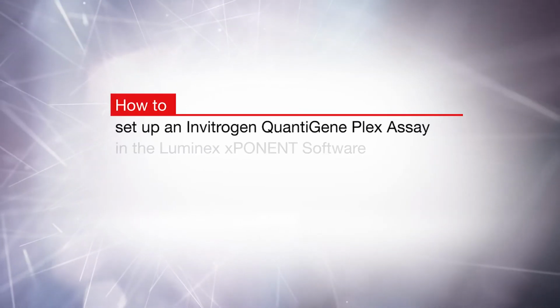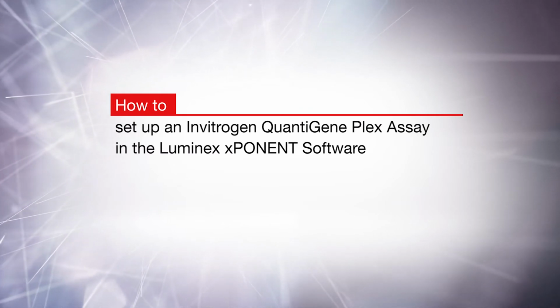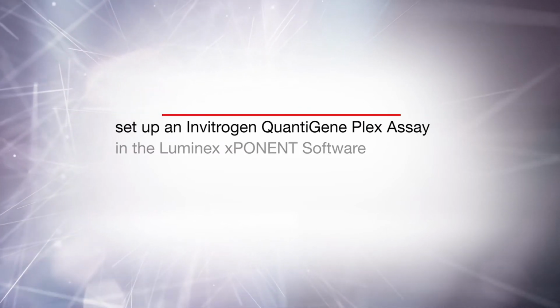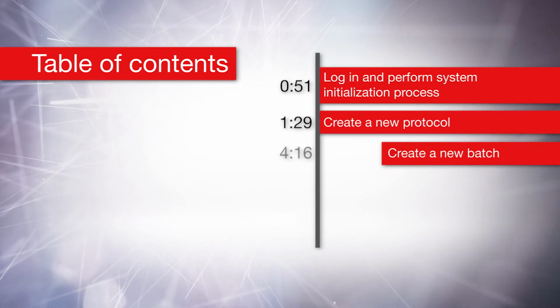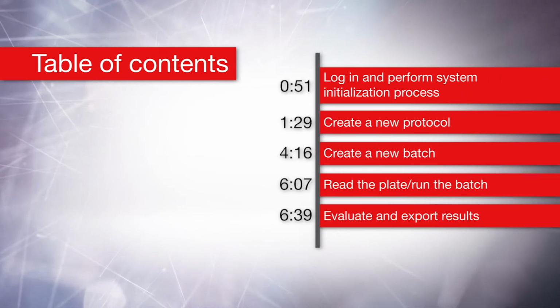In this video, we will demonstrate how to set up an Invitrogen QuantiGene Plex Assay in the Luminex xPONENT software. For the purpose of this video, we will show you how to set up a QuantiGene Plex 80-plex panel and will reference the xPONENT software for the Luminex 200 instrument.